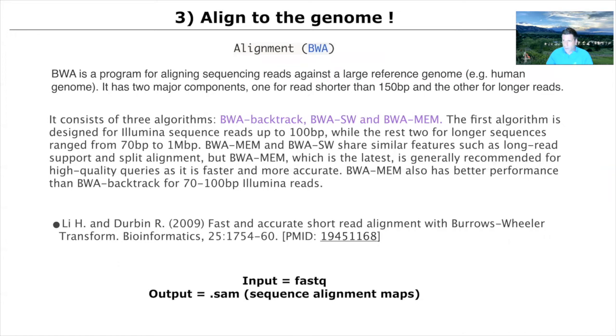So we take those out, and this is the most important part: aligning it to the human genome. This has been a complex aspect for a long time. It used to be that the reads were less than the genome, and therefore it was best to JPEG, if you will, or collapse your read sequence complexity. And now we get so many reads that somebody decided, let's just index the human genome.